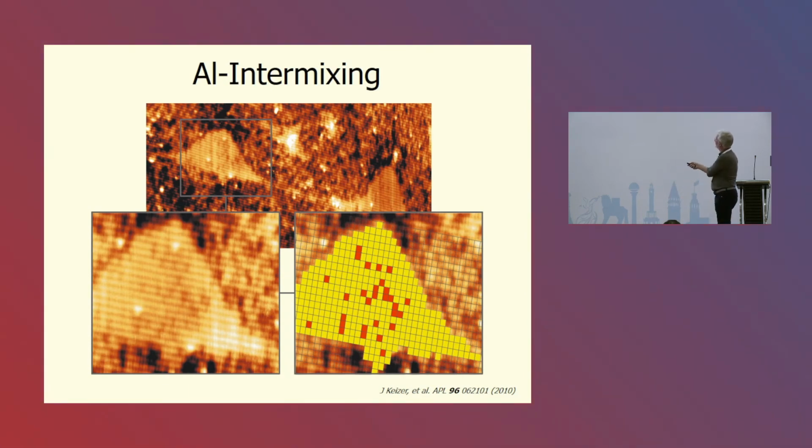If you look closely in the gallium arsenide dots, we can see individual dark features. And those are individual aluminium atoms. These aluminium atoms have been brought into the dot by this local etching, which pulls up aluminium atoms in the etching process, and by that is contaminating your pure dot.